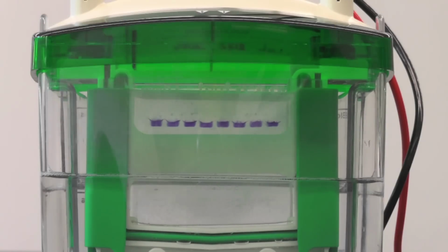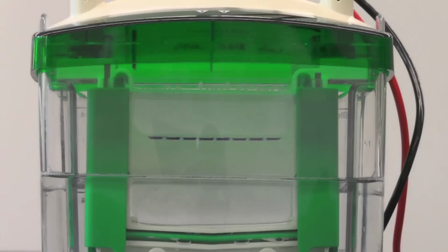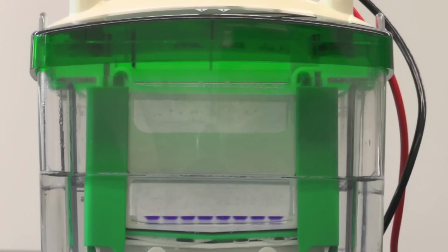You should initially observe the sample or standard solution to be condensed into a thin band through the stacking gel. Then the band will gradually migrate down the resolving gel. When the blue dyes have reached close to the bottom of the gel, stop the run.